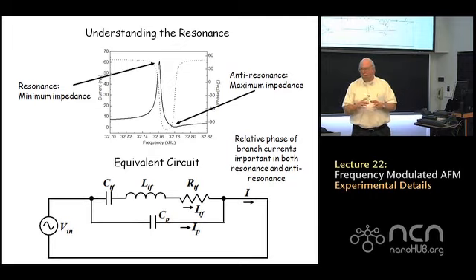This quartz tuning fork is like an electronic circuit element. You can sweep the voltage across the electrodes of the tuning fork and measure the current that flows through it. When the current has its maximum value, then you've reached the resonant frequency of the tuning fork. You no longer need to direct a laser beam off the cantilever.